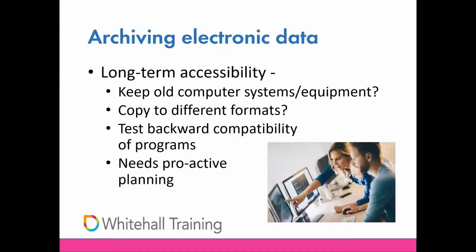Another approach can be to copy the data to different storage media. But the shelf life of the storage media is sometimes not as long as is actually required by the legislation. For example, recordable CDs. The data still needs the programs to be available as well to be able to read it. A lot of programs, as they're updated, aren't necessarily as backwards compatible as you'll need.